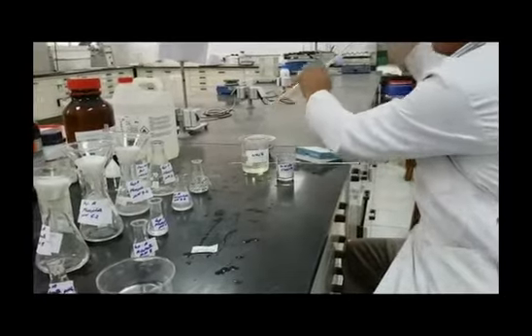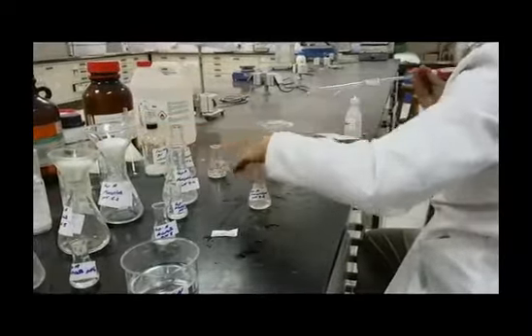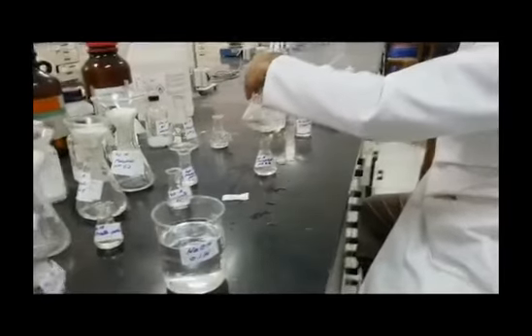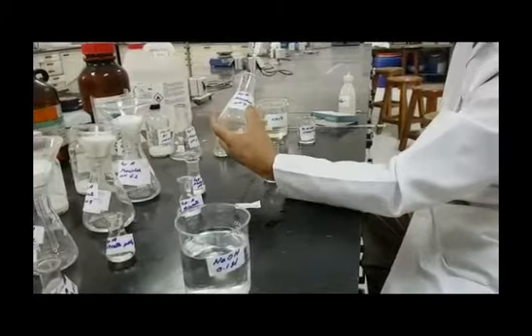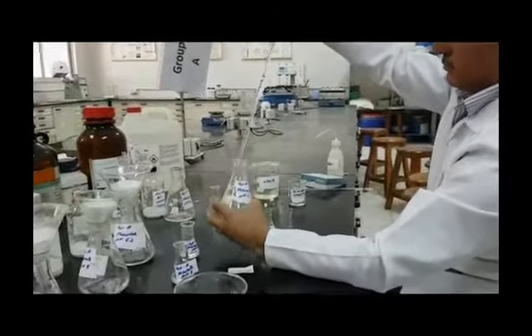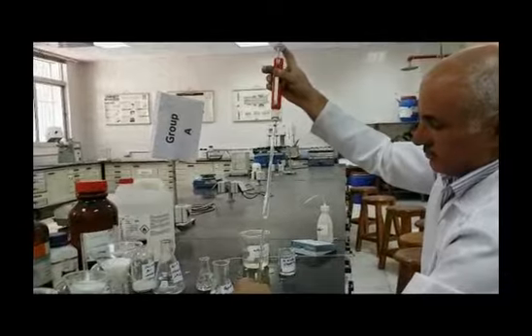And here it is worth mentioning that we selected sodium hydroxide because our samples are being prepared at different pHs, and one or two of these pHs are higher than 7. By using sodium hydroxide, this will shift the pH of all samples toward a high pH that will not affect the solubility.